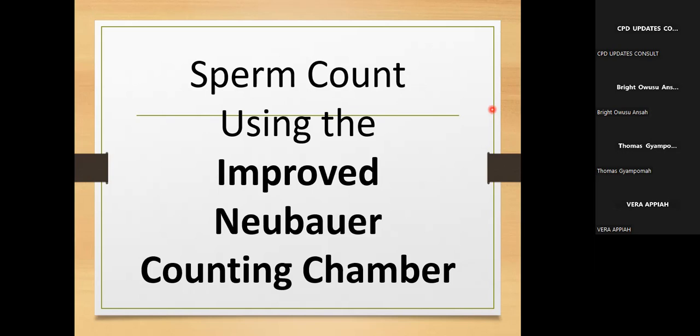Then put your test tube, in which you have a small amount of your semen, which you have already mixed very well, when it has liquefied, into the water bath or into this kind of water bath which we have just described. Within 5 minutes, you are done.